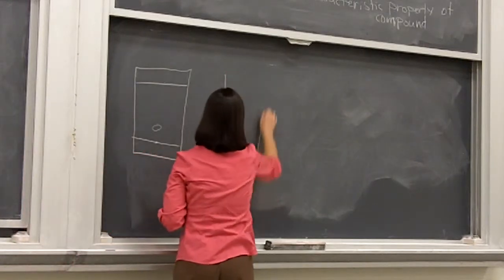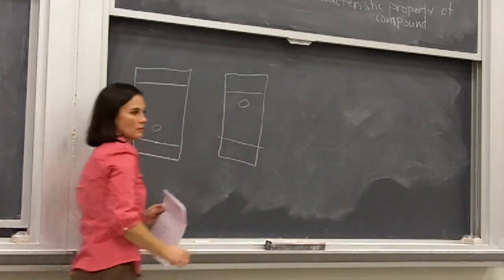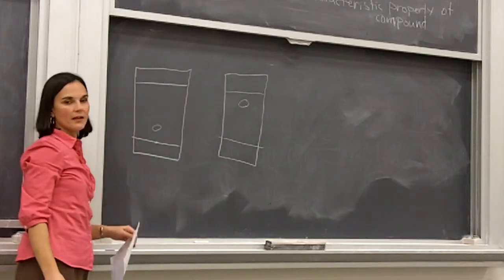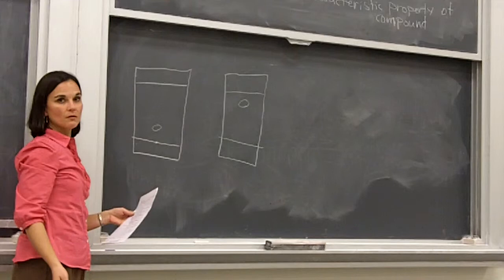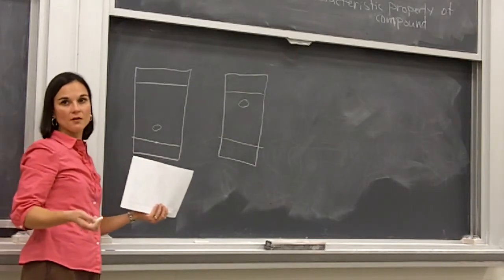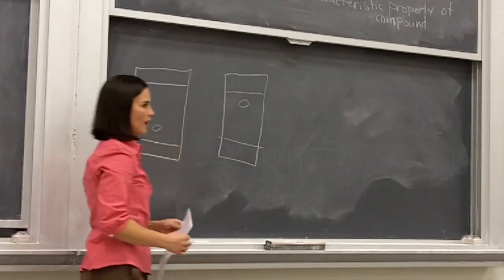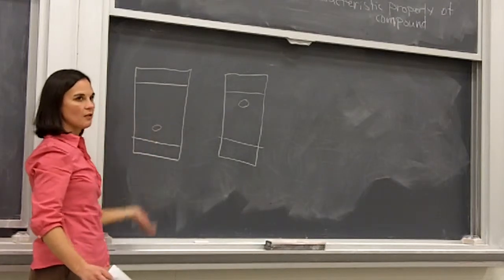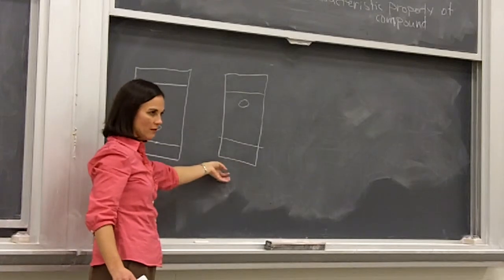Now, say you have something like this. What would you do? And you don't want it to ride on the eluent line as much. Make it less polar, so what would you do with your solvent? Have more of the less polar solvent there, okay? So less ethyl acetate, more hexane, okay? So if we need to increase RF values, we increase polarity. If we need to decrease RF values, we decrease polarity.